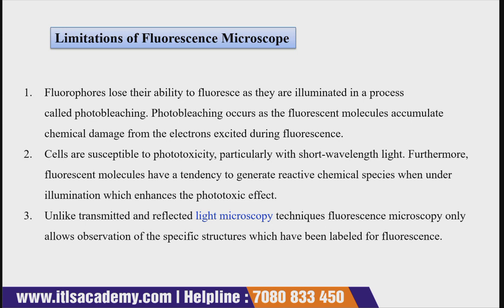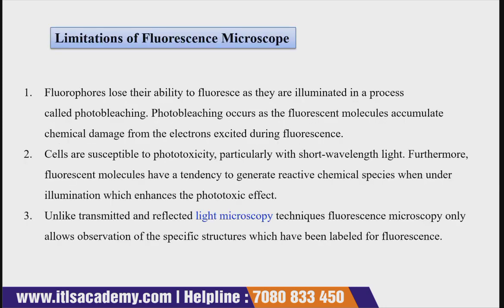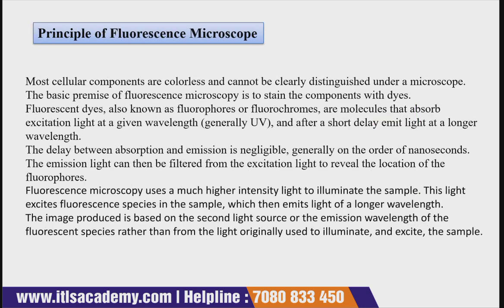So these are certain disadvantages, or you can say limitations, of the fluorescence microscope. Now before moving to the electron microscope, let's quickly understand what we have covered under the fluorescence microscope.